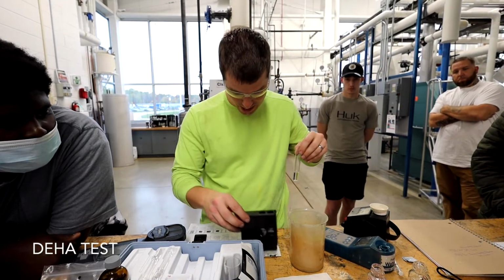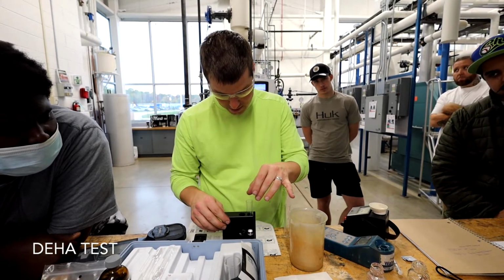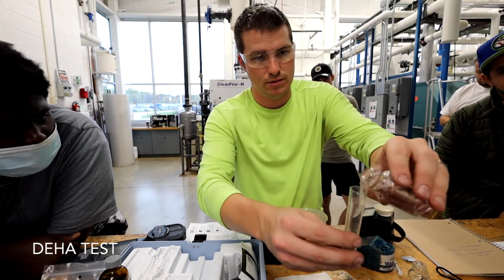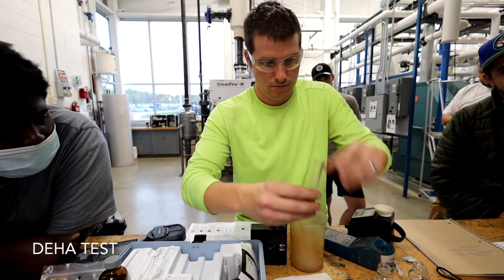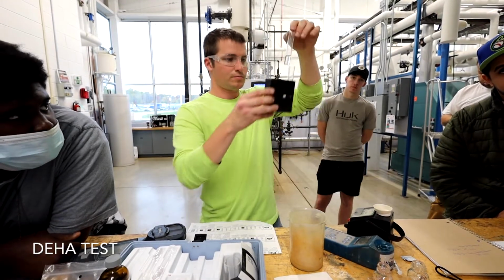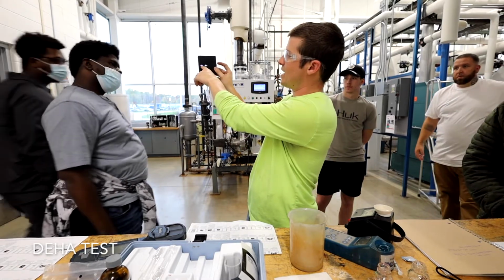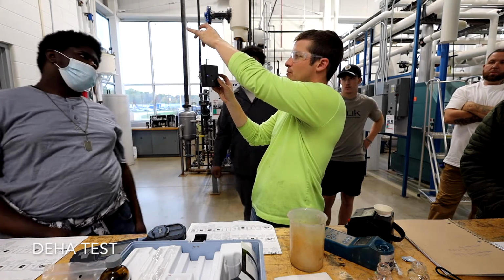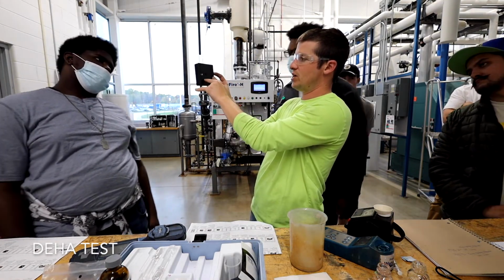So we're going to put the blank into the left side, okay? And we're going to take our sample now and put it into the right side. All right. If you're ever questioning it, obviously the blank's going to go on the side that starts turning purple, because you need the wheel to turn it purple. Your sample that's going to turn purple on its own goes on the clear side. That doesn't change as we change the reading.